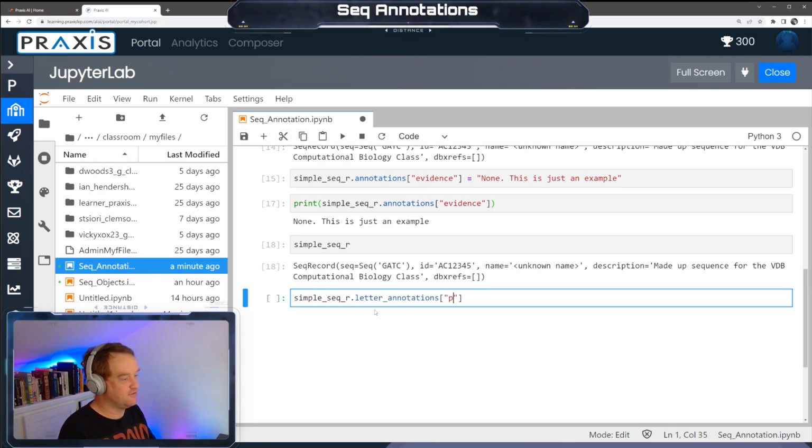This is exactly like for sequencing. It gives scores for how confident the machine or the algorithm is that each base it called when it did the sequencing is actually the base that it thinks it is. So we'll say 40, 38, 30.